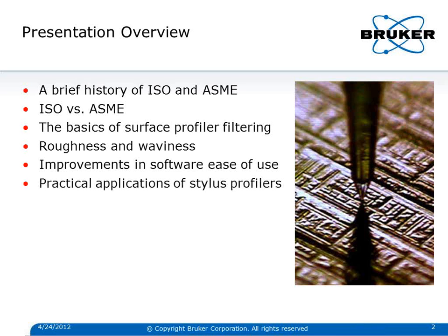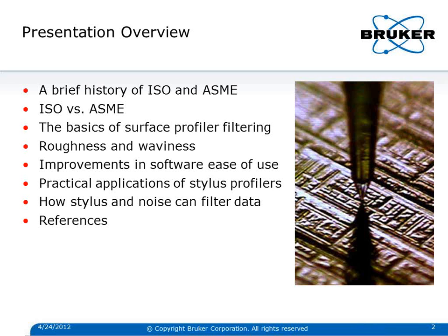We're also going to talk about some of the practical applications of stylus profilers and surface texture, and even how things like the stylus size and shape and noise and other things can affect the stylus profiler measurements and act as filters of the data, in fact. And so at the end, I'm going to provide some references that you can also check out to get more information on what was presented here today.